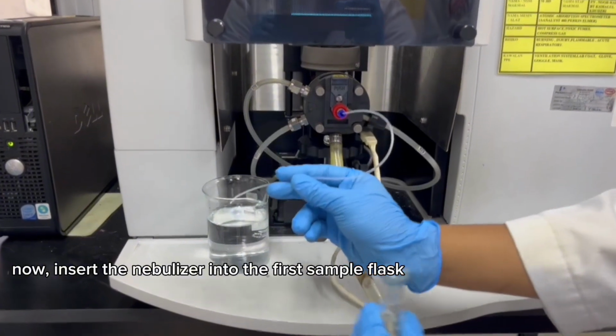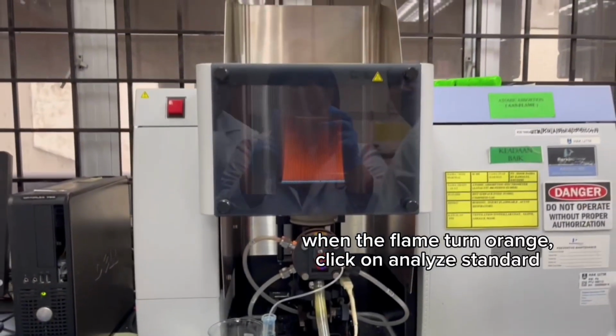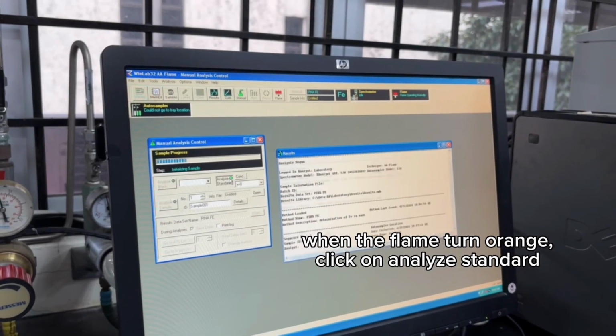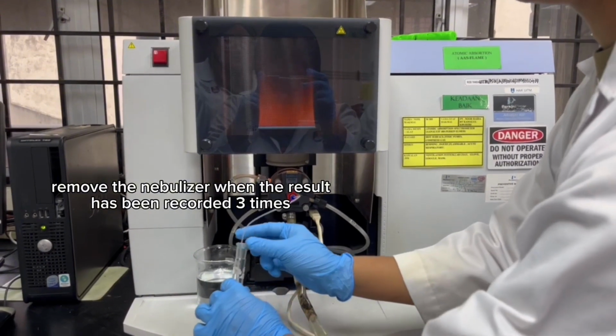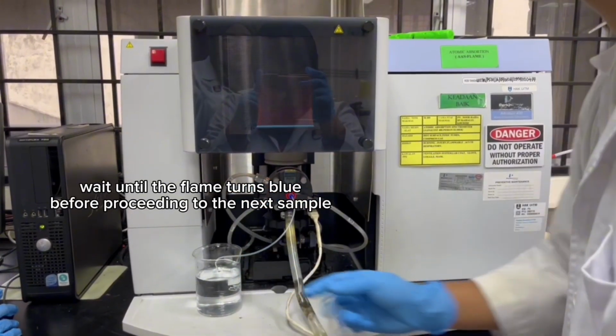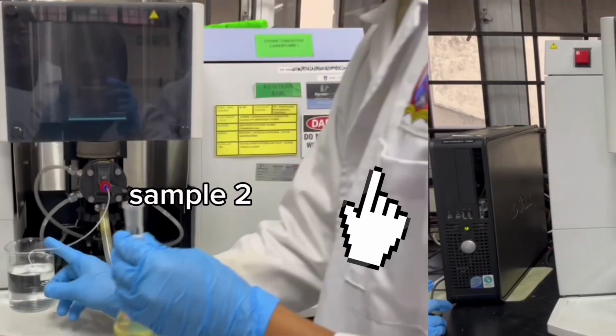And now insert the nebulizer into the first sample flask. When the flame turns orange, click on Analyze Standard. Remove the nebulizer when the result has been recorded 3 times. Wait until the flame turns blue before proceeding to the next sample.